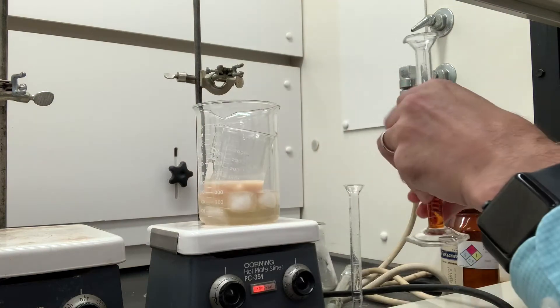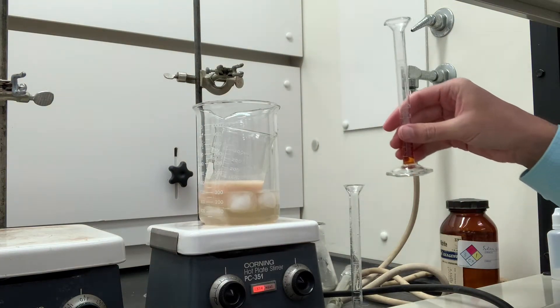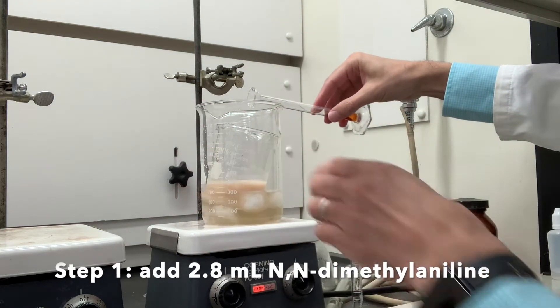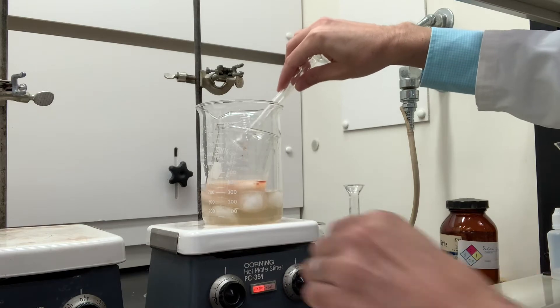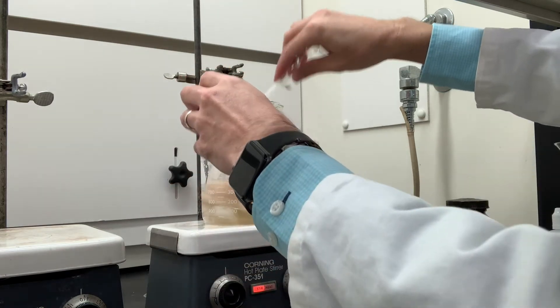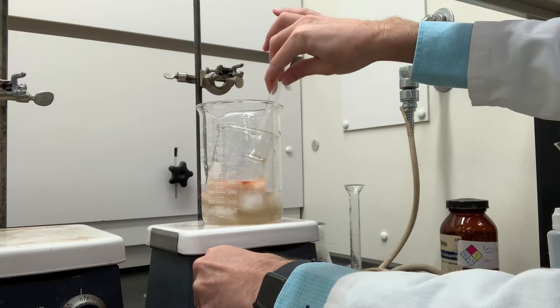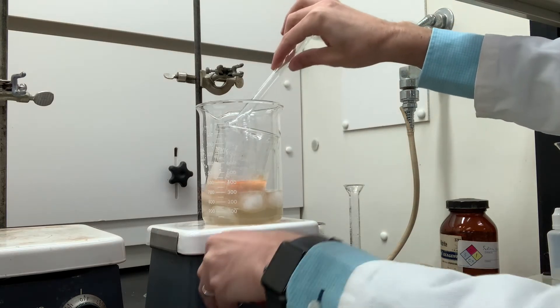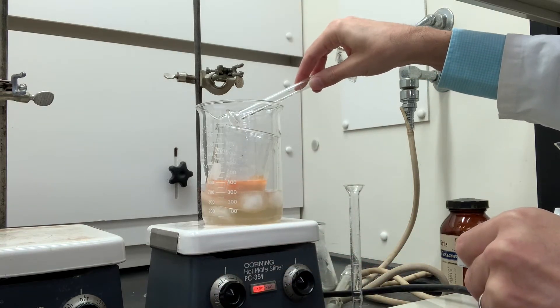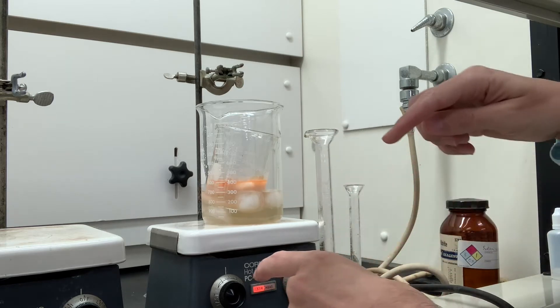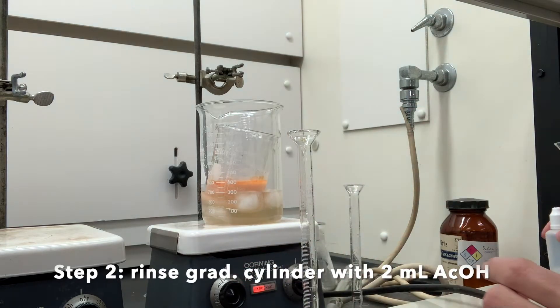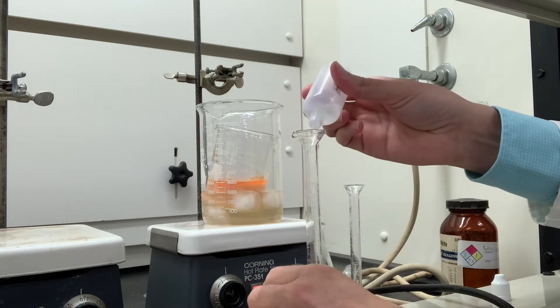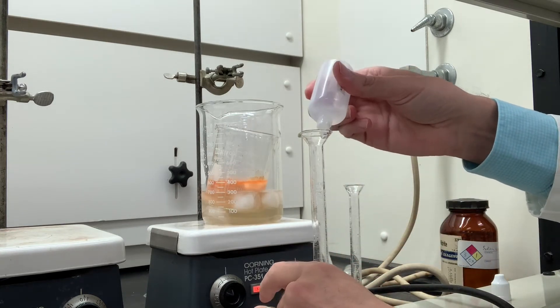So the procedure tells us to pour this into the 400 milliliter beaker now. And then we'll rinse the dimethyl aniline with two milliliters of acetic acid just to make sure we get it all in there.